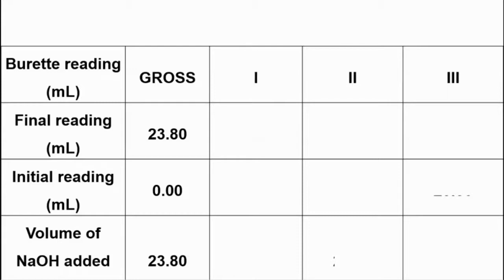But let's say if your sodium hydroxide is not enough, maybe some of you get 25 or 26 ml. So I don't think it is enough for you to continue with the first titration. So you need to add more sodium hydroxide. And that's why what I'm going to highlight here, actually it is not necessary to start from 0, guys. Not necessary to start from 0.